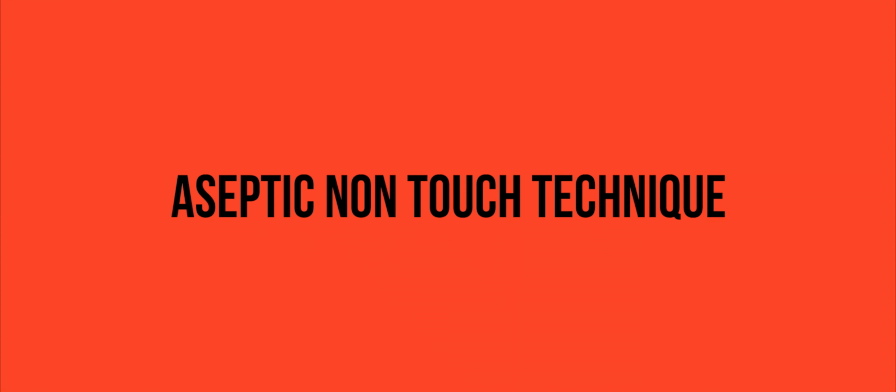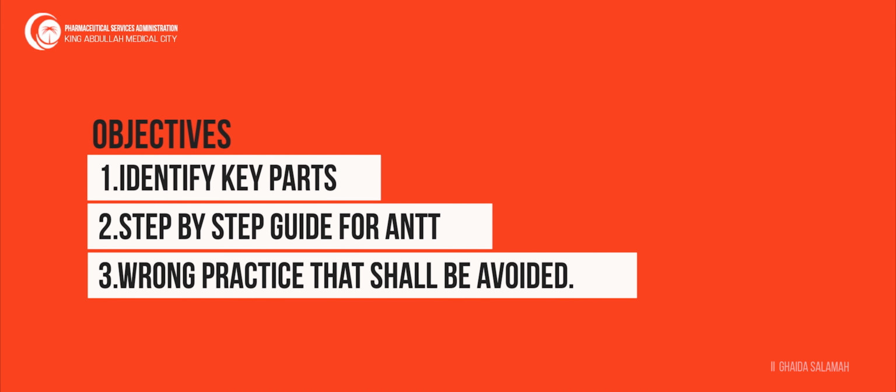This video will be about aseptic technique, aseptic non-touch technique, sterile compounding on patient units. Our objectives: to identify key parts, a step-by-step guide for aseptic non-touch technique, and wrong practices that shall be avoided.